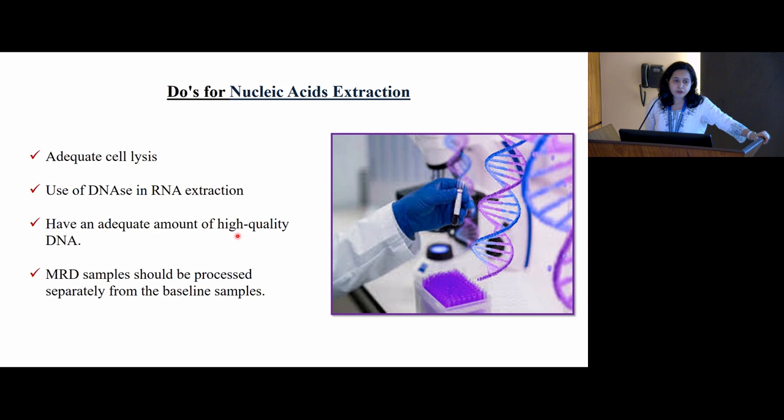The quality of DNA is also important. Also, when you are extracting your samples, the baseline sample should be extracted separately and the MRD samples should be extracted separately, because otherwise it can create a problem in your samples. You can get some contamination during these steps.